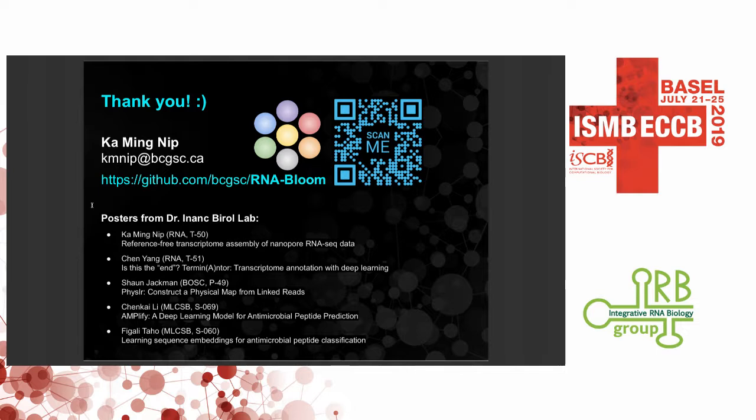Hi, very nice work. I'm curious about your sensitivity for being able to detect alternatively spliced isoforms, given that you're clustering reads based on the minimizer hashing scheme. My worry is that alternative splicing isoforms are going to get clustered together, and then you're going to end up with a consensus transcript that represents maybe one of the isoforms or some chimera between the isoforms rather than the independent separate isoforms.